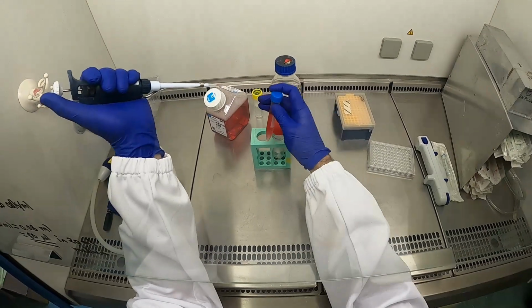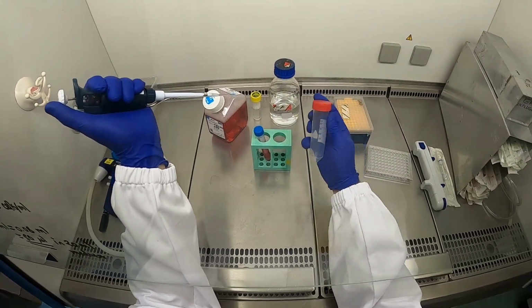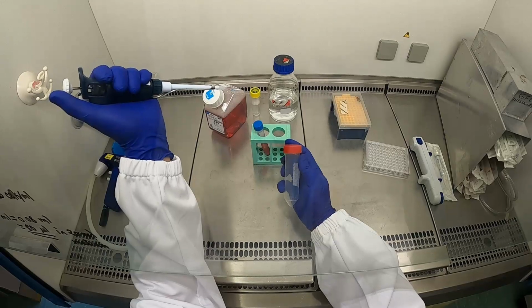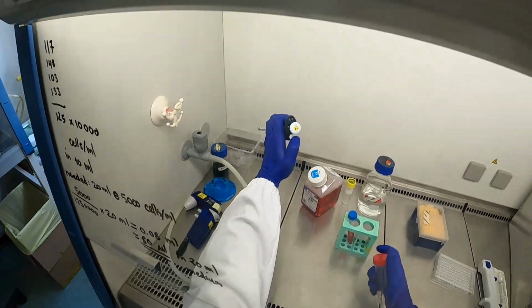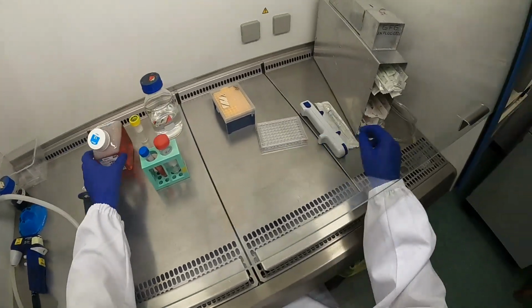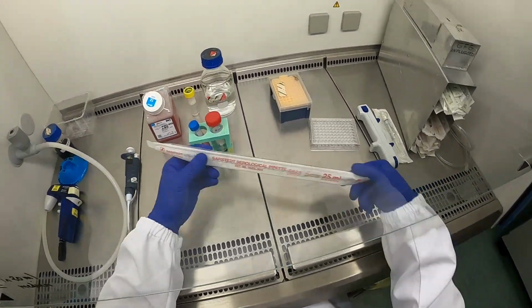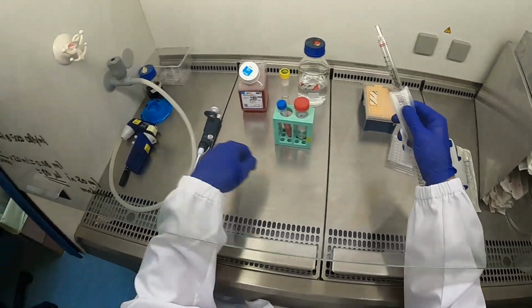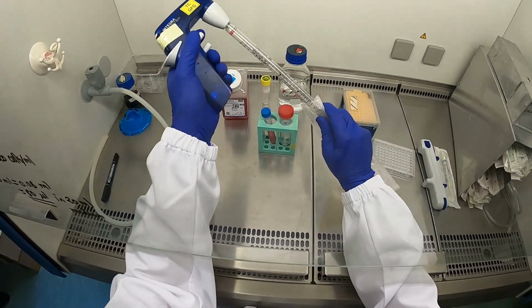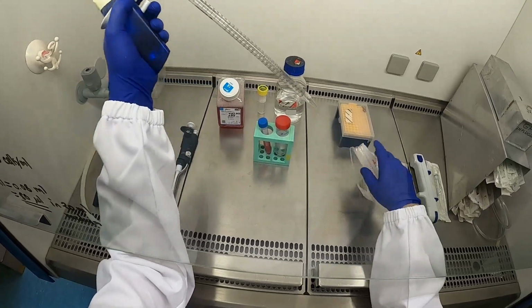Add that to a large 50 ml tube. Pipette against the wall, so you make sure you have the whole 80 microliters. And now let's add 20 ml. We take a 25 milliliters tripette. Take the medium.